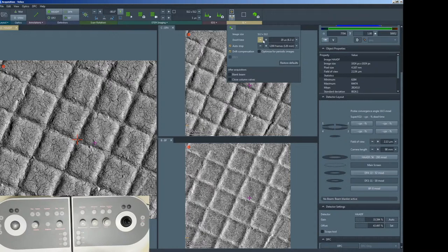Another thing you want to set up is the dwell time. Dwell time controls how long one scan is going to be. Here it has some preset settings, and in the brackets it tells you the actual frame time. It's very straightforward that you don't want this frame time to be too long, because in that case your results are going to suffer a lot from sample drifting.